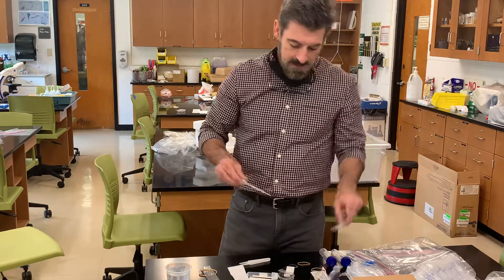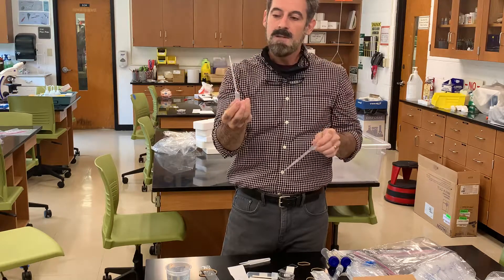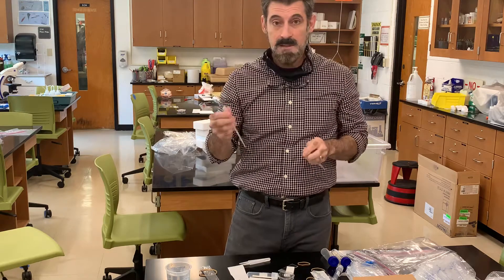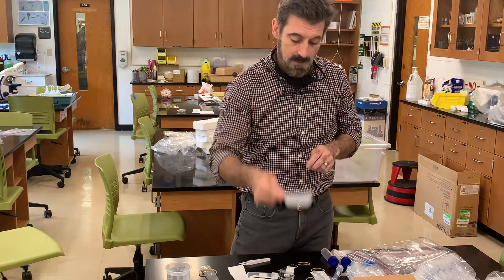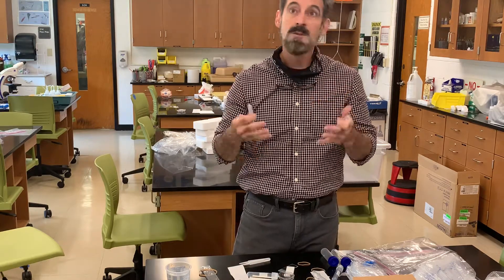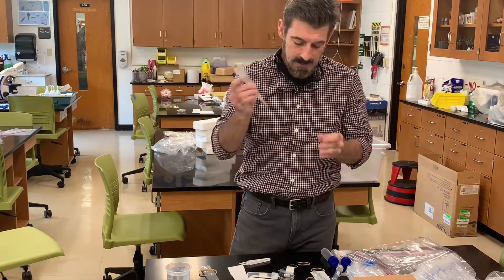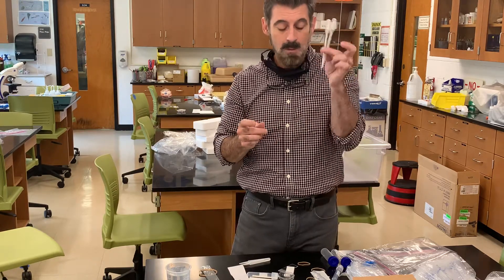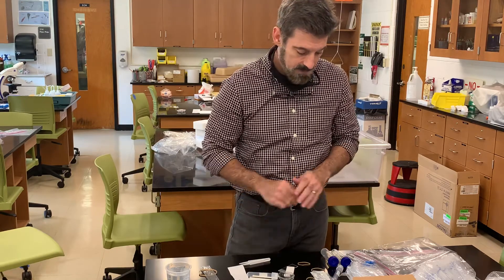In this first lab you're going to have two different types of disposable pipettes — a smaller one for lesser volumes and a slightly larger one. During the first lab, you'll be pipetting water into the weigh boat on the balance and then weighing it; the weight and volume should be equivalent, so one milliliter equals one gram. You'll also use these pipettes for serial dilutions and a number of other labs throughout the semester, so hold on to them.